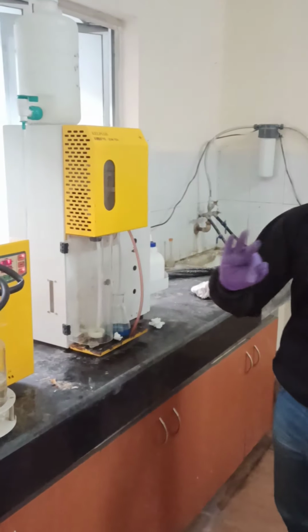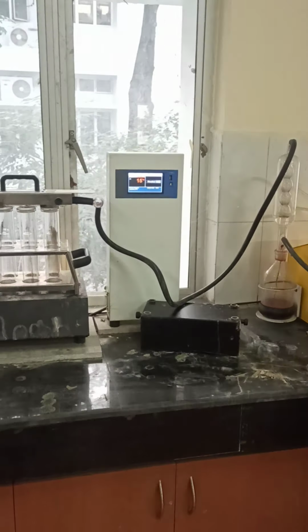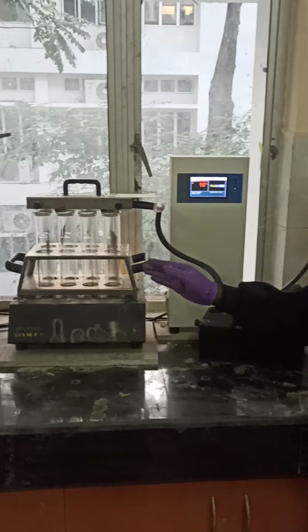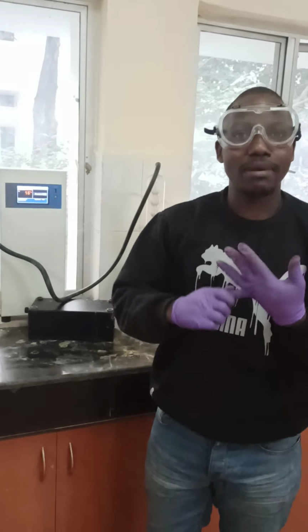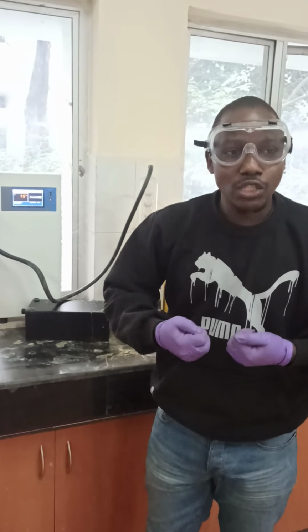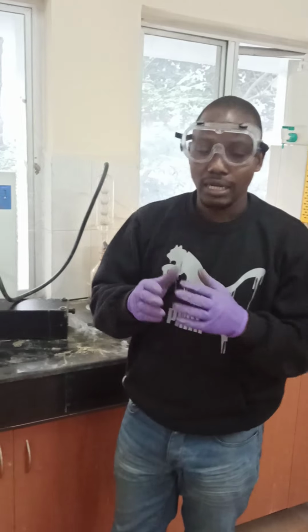The system has 3 main activities. The first activity is digestion. This is the digester system up here. The main activity is to digest the particular sample that you are having. Probably you are having plant-related samples or soil-related samples, and you want to determine the amount of nitrogen in that particular sample.